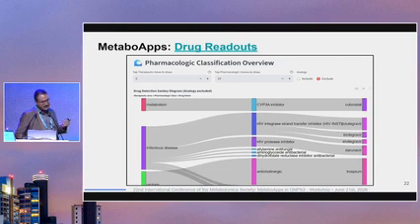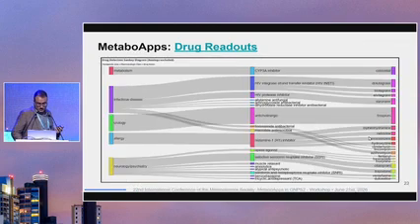So as I said, for the Sankey plots, you also have an interactive version of that. Just as an example, by default we have the top 5 therapeutic areas, but you can change that for any classifier that you have on your metadata. And then you also have the pharmacological classes. In this case, we have the top 10. And then you can track which of the compounds are related to any type of therapeutic area, any type of use.